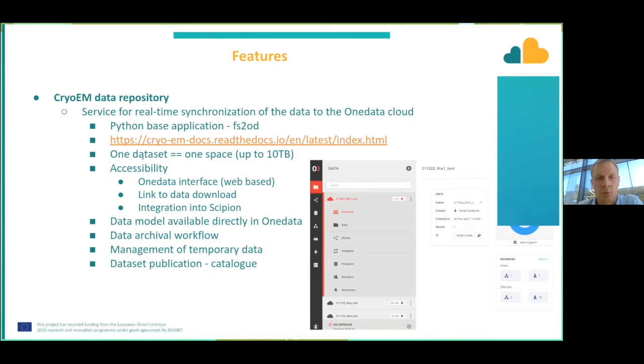and adds the metadata to the raw data, submits of course the data into the cloud, and manages the transfer of the data between individual cloud providers. Plus, of course, it is responsible for handling the conditions for data archival or alternatively deletion of the data.